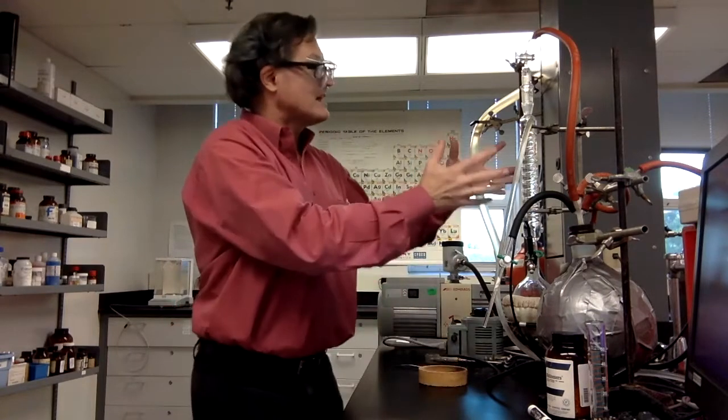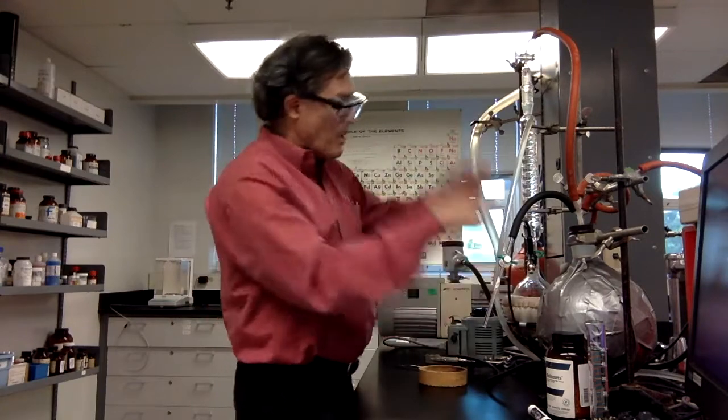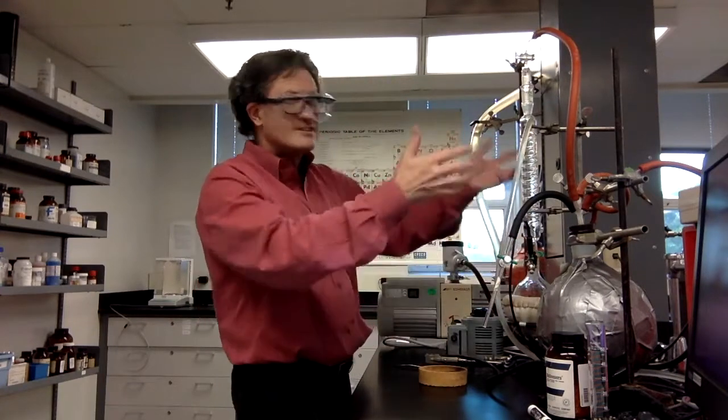What's the maximum pressure? This is a vacuum system. It wants to be at atmospheric pressure or below. We don't go above atmosphere. Don't want to go much above 100 kilopascal, because if we get above 100 kilopascal, poof, you can start to blow things off of here. We're not going to do that. So we don't go much above 100 kilopascal. We can get to 100 kilopascal, but don't go above it.